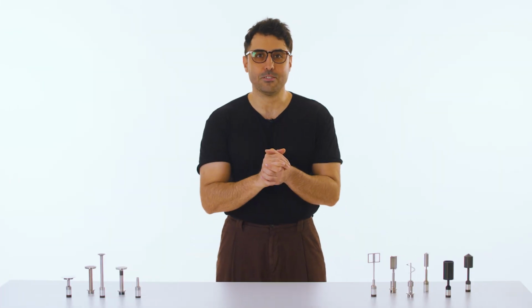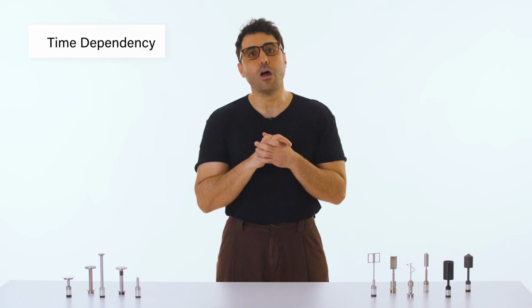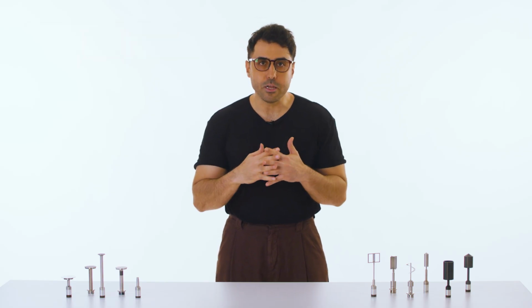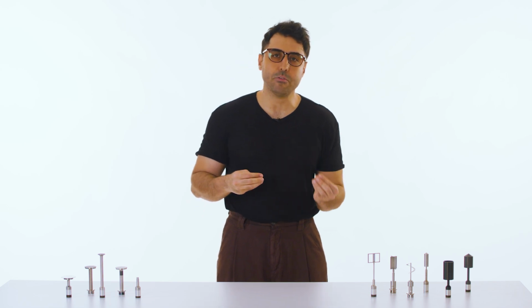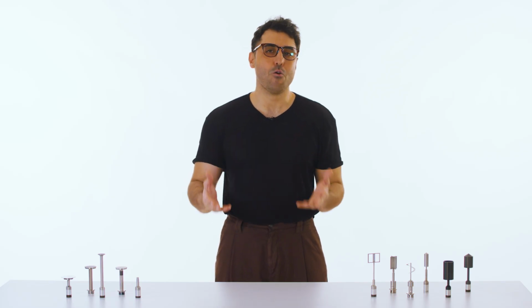And that brings us to the end of this episode. Across these last two episodes, we've talked about time dependency, yield stress, and wall slip. Because these concepts are tightly woven together, you really can't separate them. And once you understand how they influence each other, your rheology measurements become far more reliable and far more meaningful.